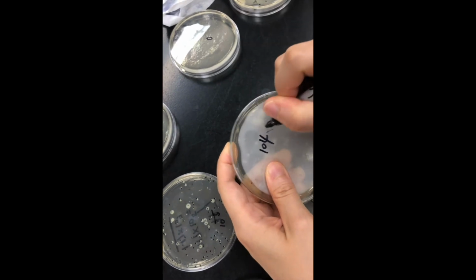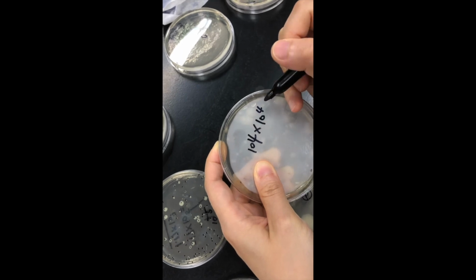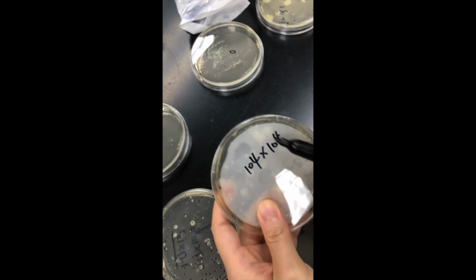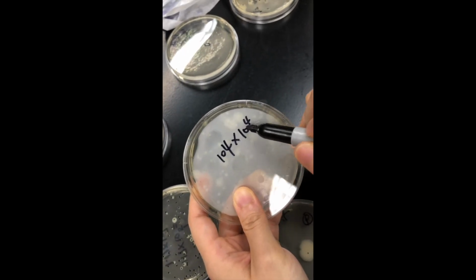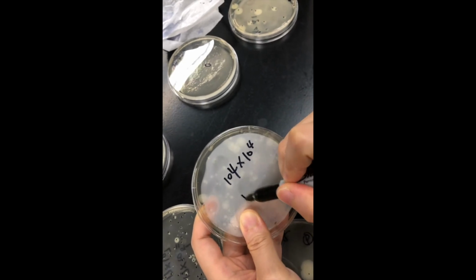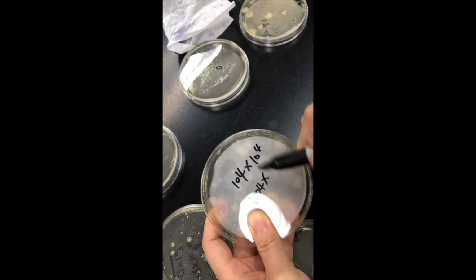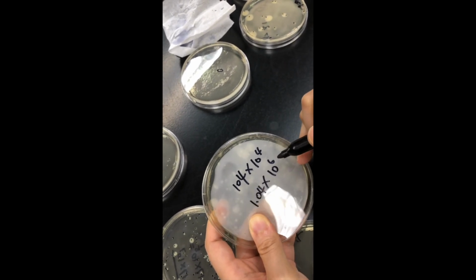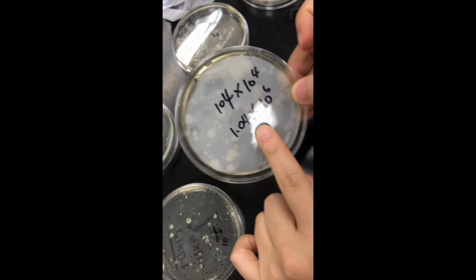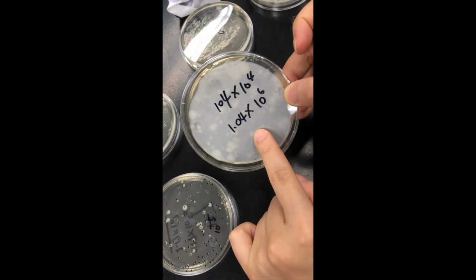So you know how to get the concentration of your 10 to the minus 4 plate by multiplying the number of colonies by the dilution factor 10 to the 4. And we need to write in scientific notation. This equals 1.04 multiplied by 10 to the 6, right?